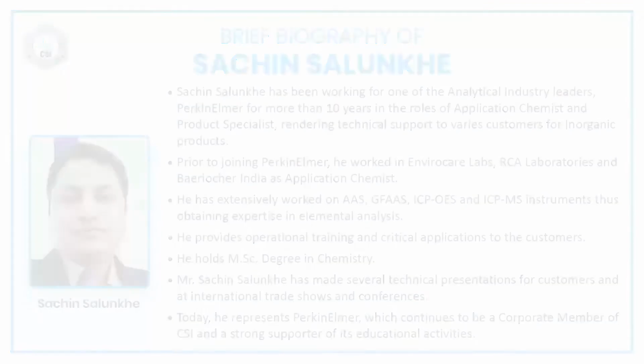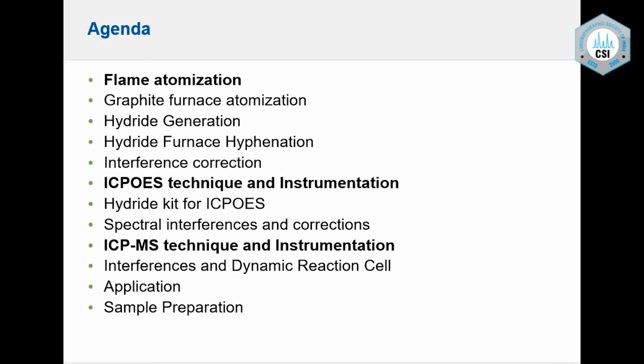Good morning, everyone. The agenda of this webinar is atomic spectroscopy techniques for elemental analysis and elemental impurities. I'll be talking about flame atomic absorption spectrometer, graphite furnace atomic absorption spectrometer, and the hydride kits for lower detection of some of the volatile elements. Then interferences will be discussed.